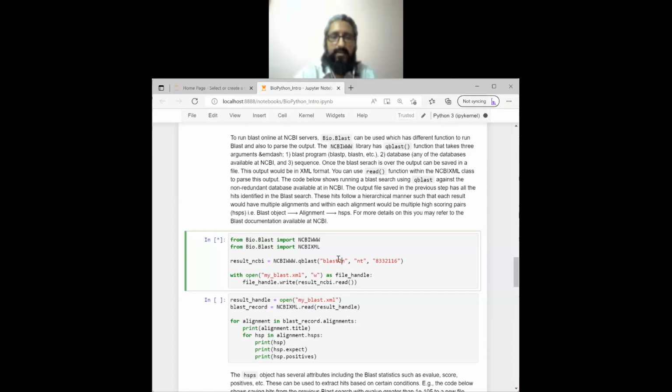If QBLAST supports BLAST2N, then maybe you can specify two GI IDs, but I'm not sure about that. You need to look into the QBLAST manual and see if it supports BLAST2N.